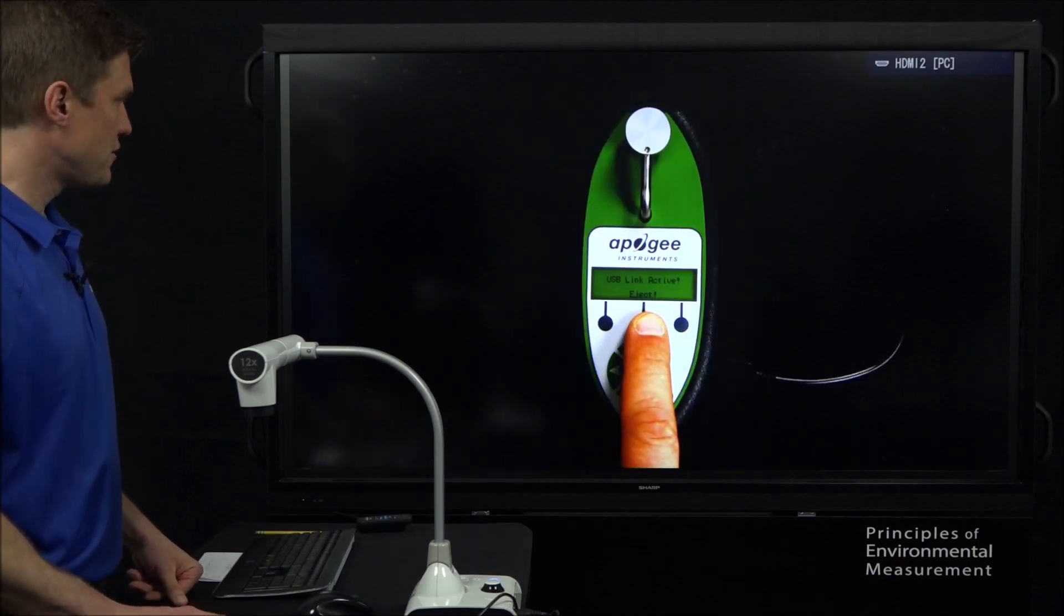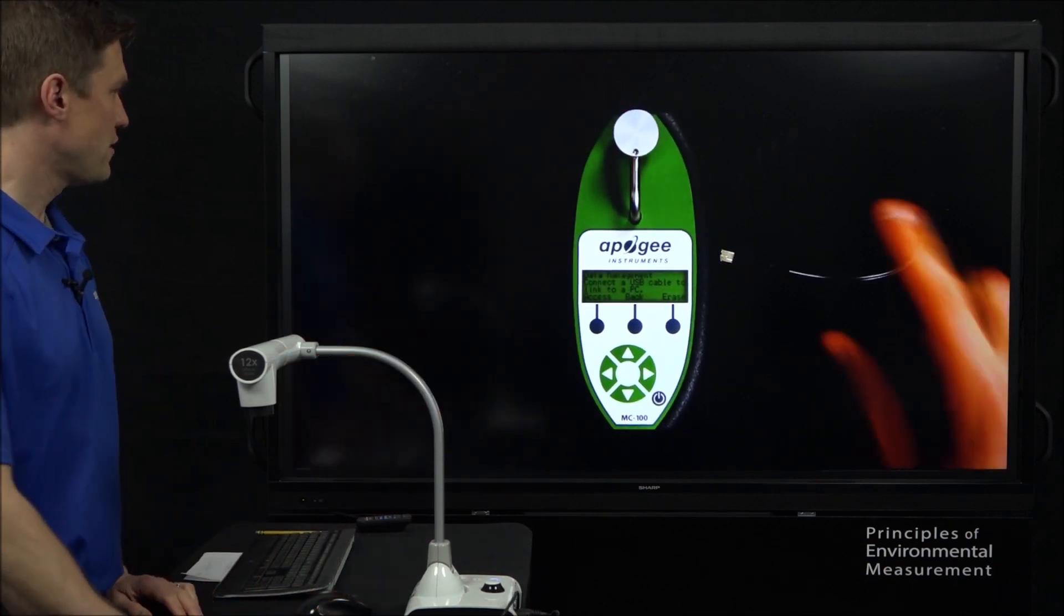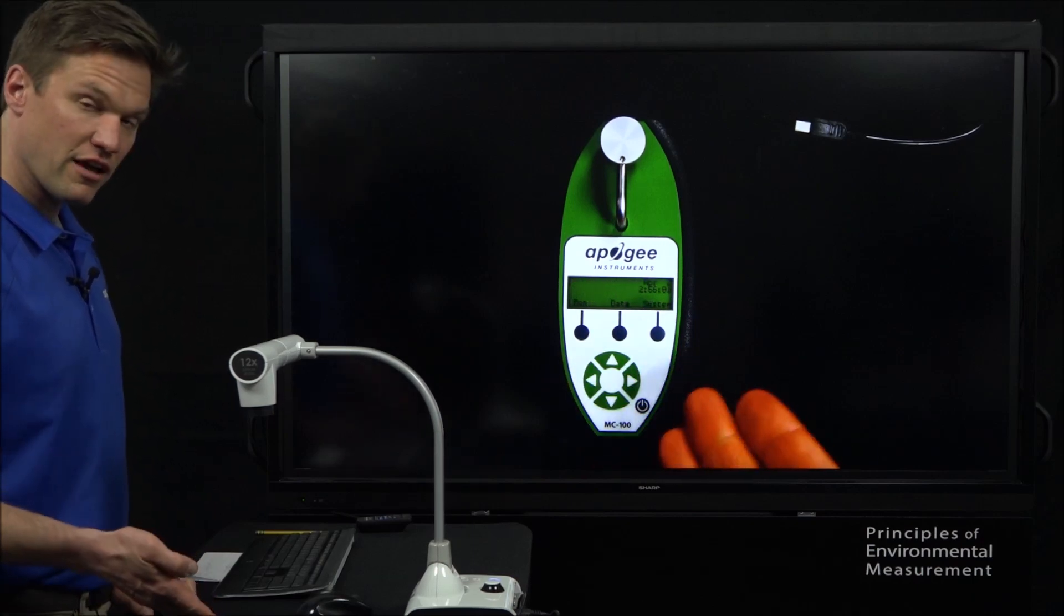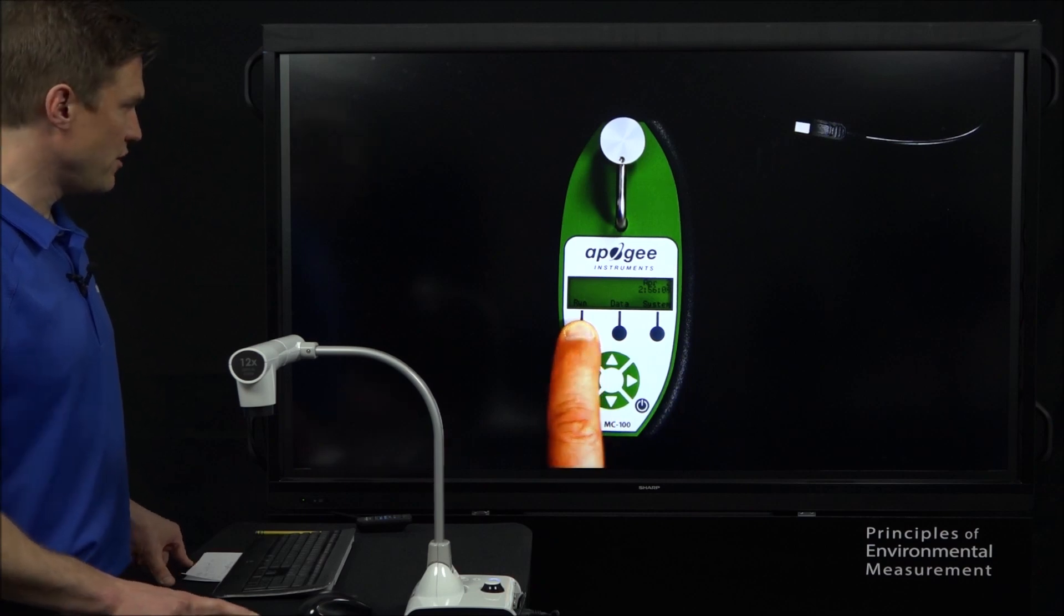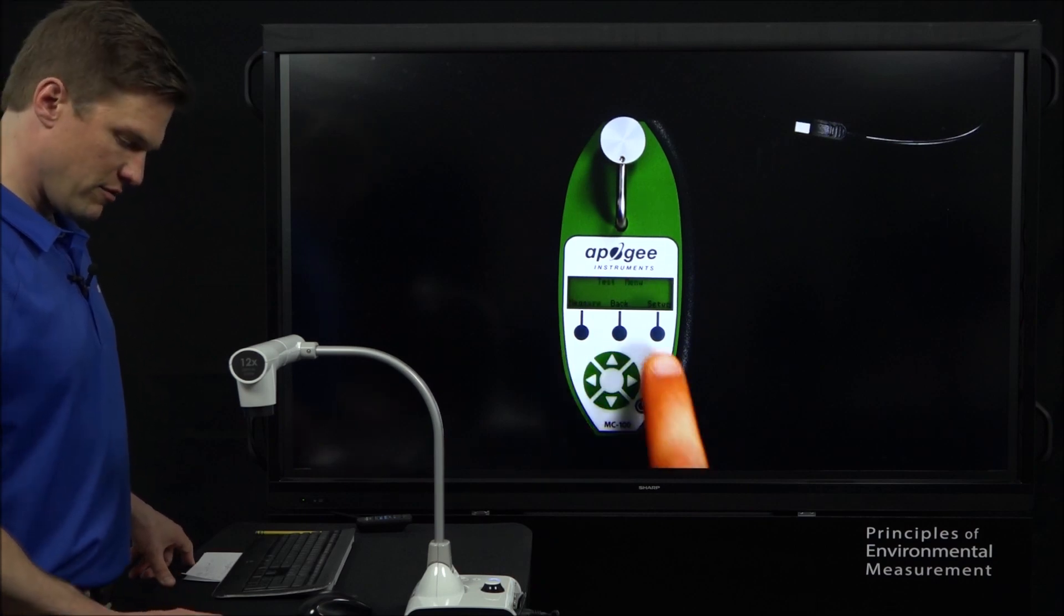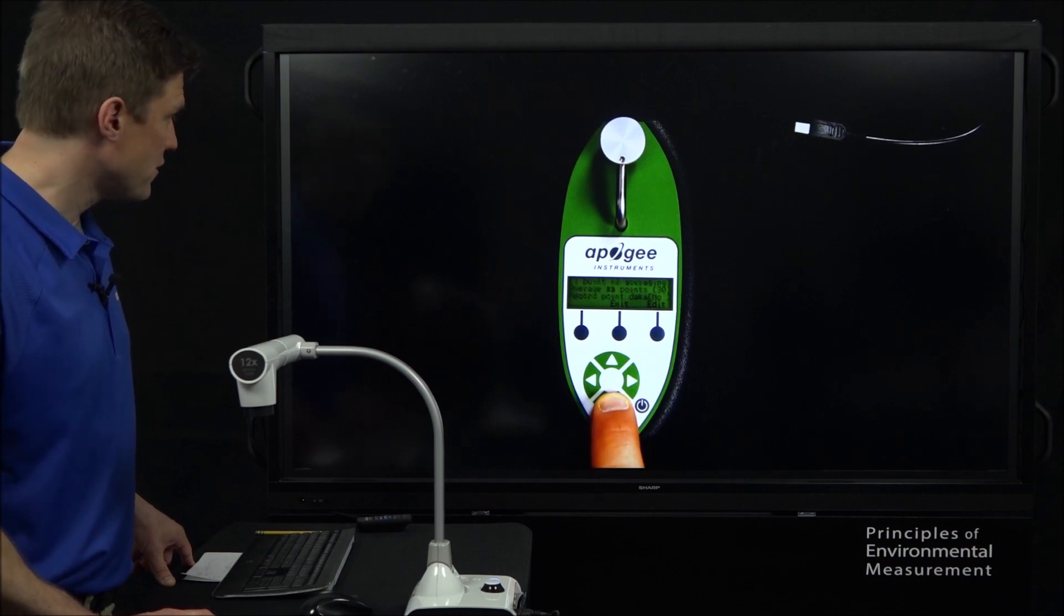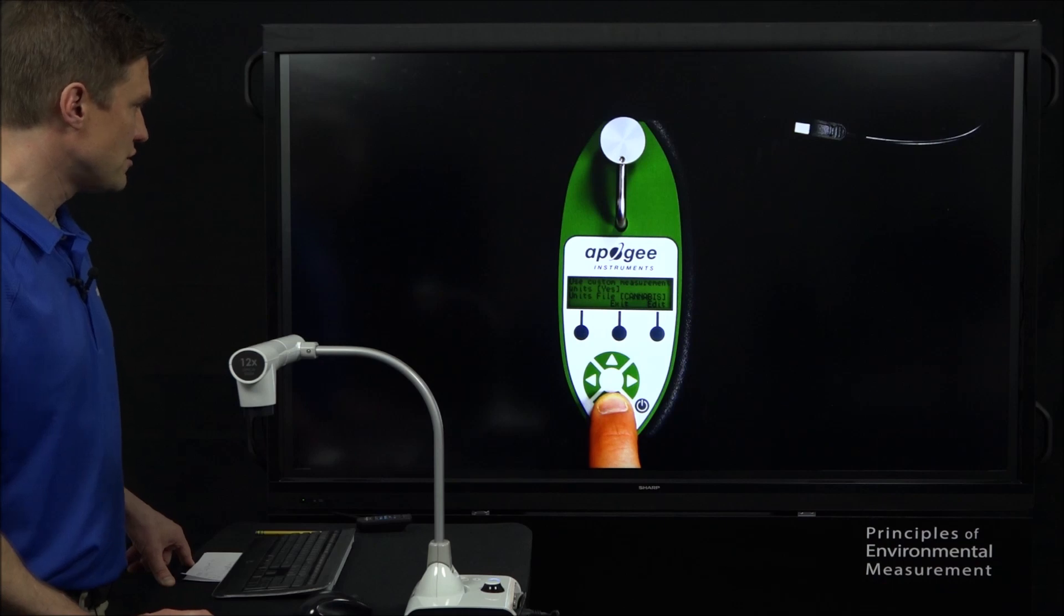Okay, we'll just hit this eject button. It says unplug the USB cable. Okay, so now we're back to the usual screen. We expect we should have new coefficients on here. We can select if we want to. So to get to them, we hit run. Then we hit setup. Then we hit the down arrow a couple of times until we get to a screen that says use custom measurement.